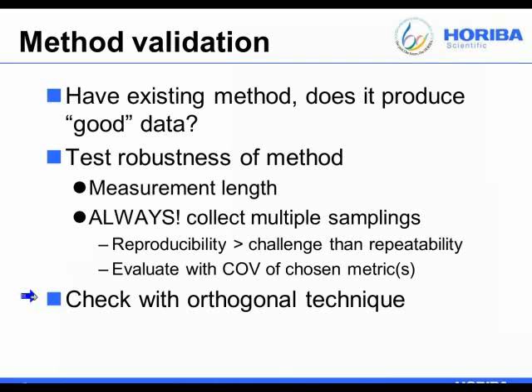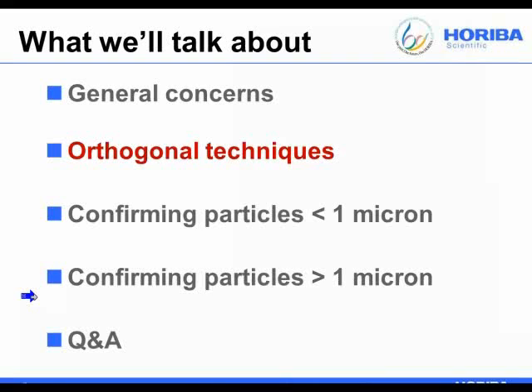And then finally, again, check with an orthogonal technique. Check with something else that's suitable and see if you get the right answer. Or the same answer, I should say. All right, so now we'll talk about the technologies themselves.